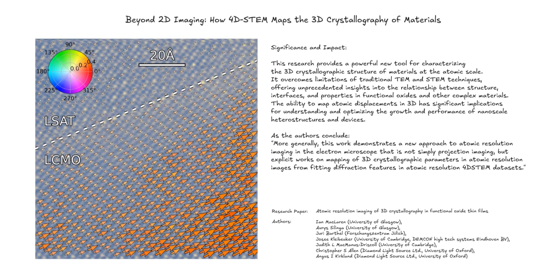That brings up another fascinating aspect of the research: the implications for controlling the A-site modulation direction in perovskites. Can you elaborate on what A-site modulation is and why controlling it is so important?